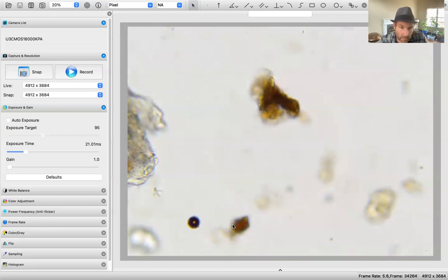Oh, there's an actino. Oh, goodness gracious. We got some facultativeness going on here. 1, 2, 3. I'm going to count that as a 4. 0.4. Not that I need to tell you, though. 0.4.